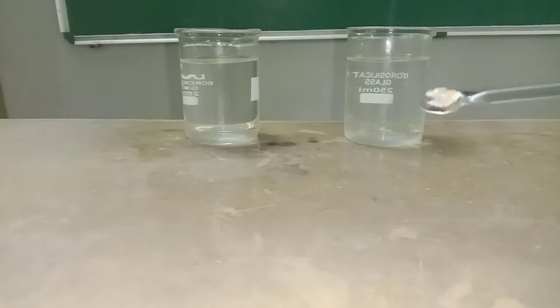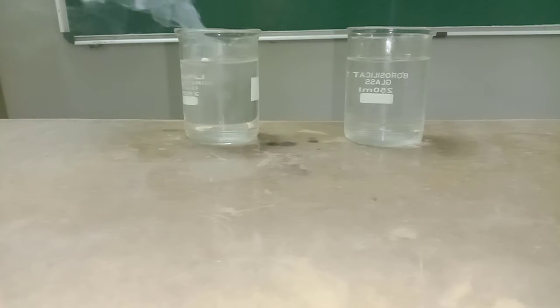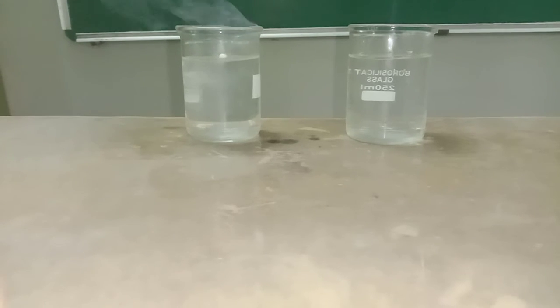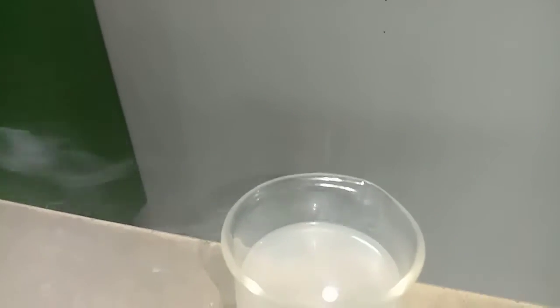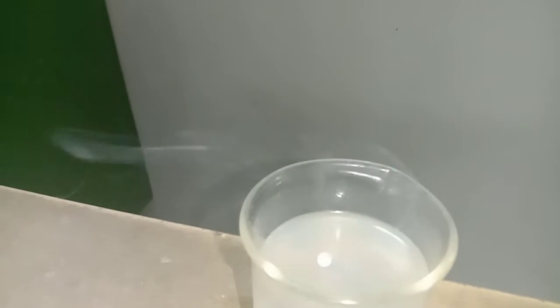In front of you, two beakers are there. In the two beakers I have taken water. I am going to add the sodium metal to one of the beakers. So we will check out what is going to happen. You can see it will produce flame and there will be some fire also.